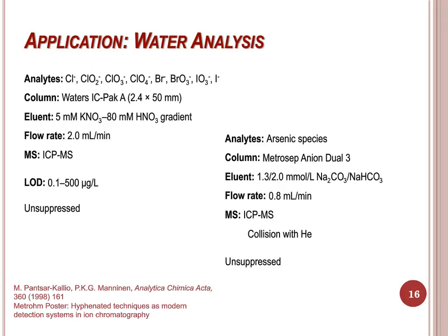The detection of chromium and arsenic-containing compounds such as chromium, chromate, arsenate, and arsenite also frequently utilizes ICP-MS. Both chromium and arsenic species are known to suffer isotopic interference from carbon and chlorine-based species in ICP-MS. Regarding the formation of the interference species, the use of organic solvents is therefore not recommended for chromium or arsenic analysis. The inclusion of collision cells into ICP-MS instrumentation for tandem MS has greatly reduced the interference effect by dissociation or fragmentation of interference and results in improved specificity for analyte elemental analysis.